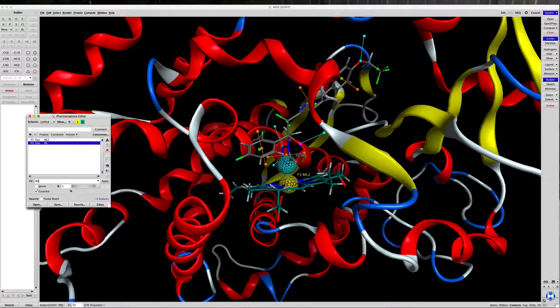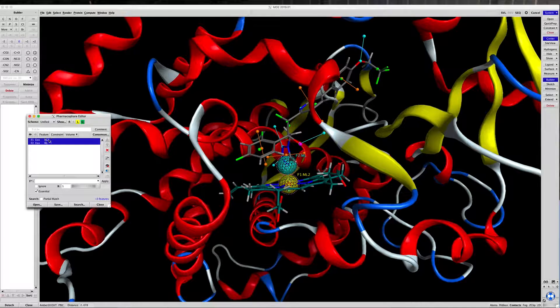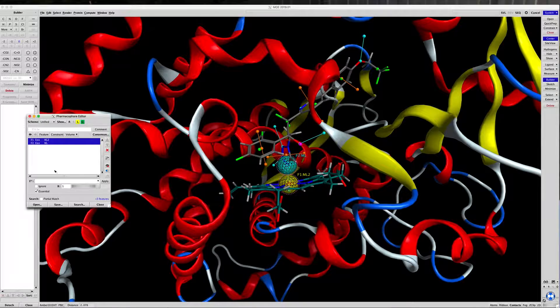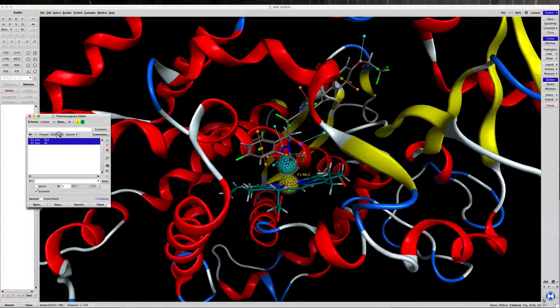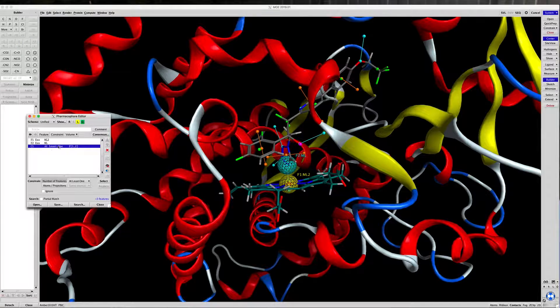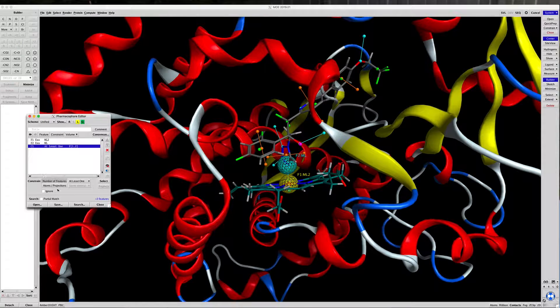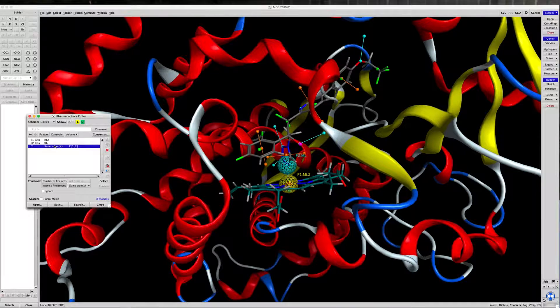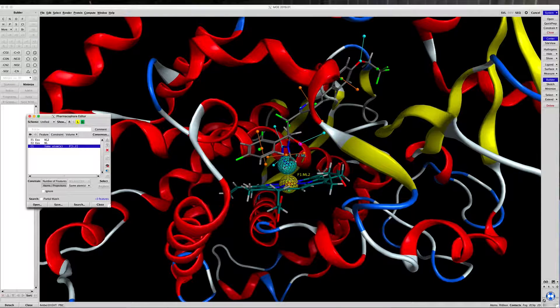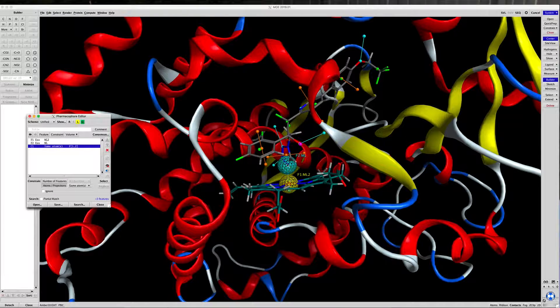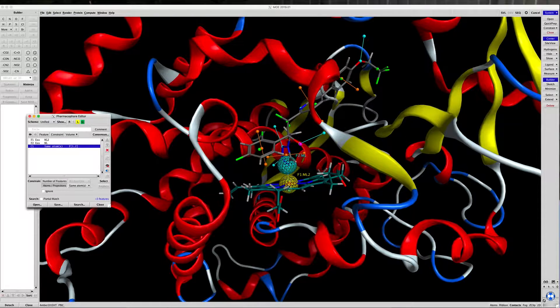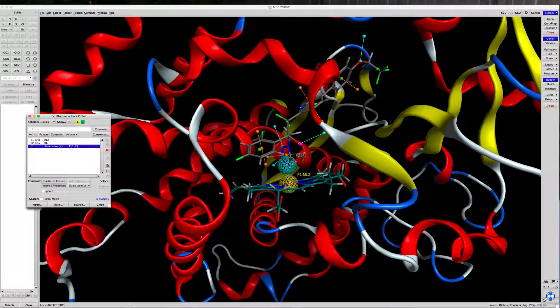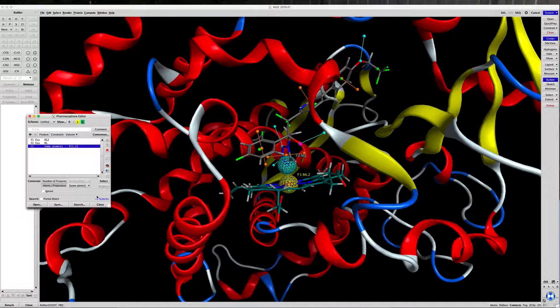And we're going to select both of these features and click on Constraint. So what we're going to do is we're going to tell the software that both of these features have to be here, and they are interacting with each other.